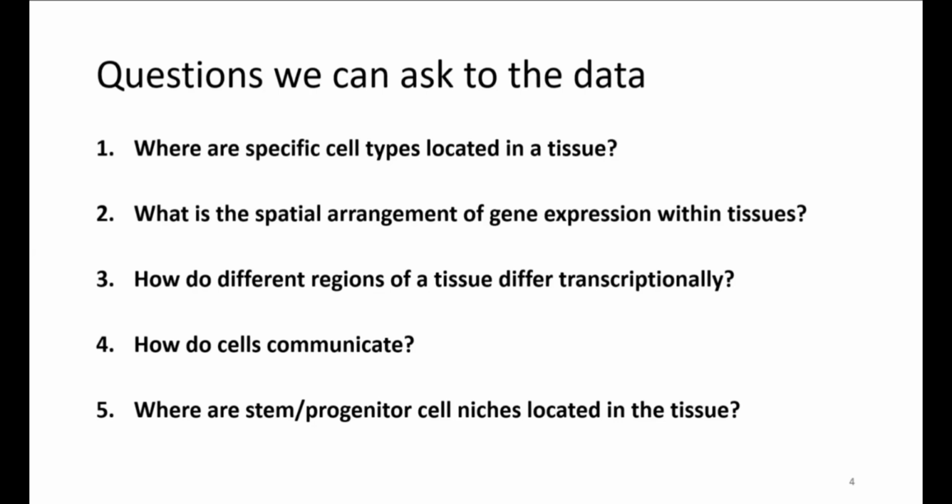My idea for today is to introduce you to some computational methods that have been developed specifically for spatial sequencing. I'll start with how you can directly apply methods that you already heard about from Katrin yesterday on single cell RNA sequencing.